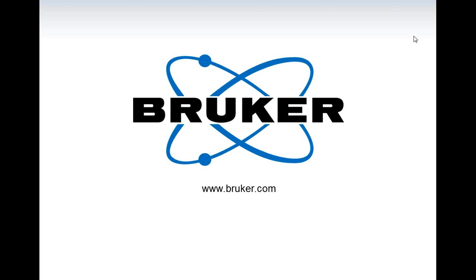Is it possible to determine with PeakForce TUNA the difference in terms of surface energy on the surface before and after corona treatment? So I guess the question is on surface energy. No, I don't know right now how surface energy would relate to conductivity.